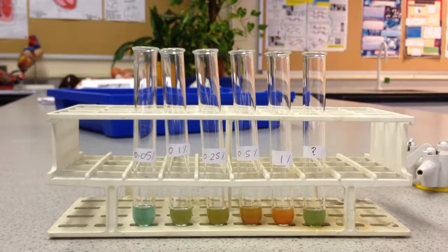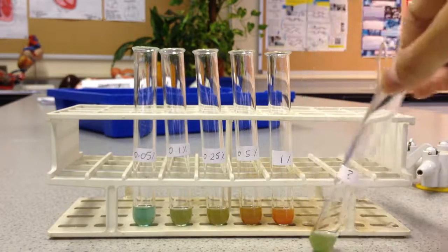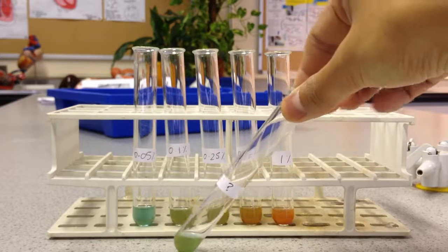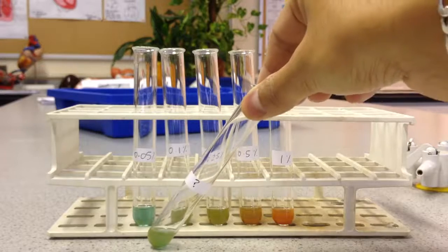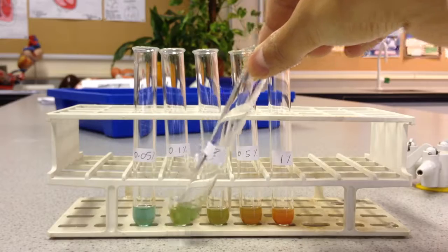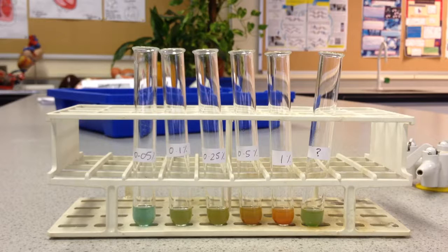Okay, now a very easy but still qualitative way to estimate the amount of reducing sugar in our test solution would be a simple comparison of which of these tubes the color is closest to. So I would estimate that it's around between 0.05 and 0.1%, just in terms of simple color comparison. But that is not quantitative, as I said. That's still a subjective way to estimate that concentration. It's still depending on the observer's point of view of what color it's closest to.